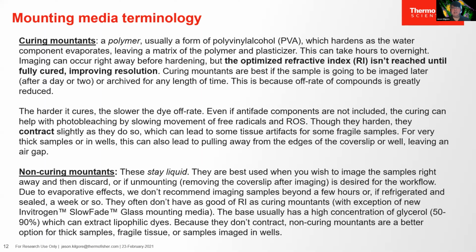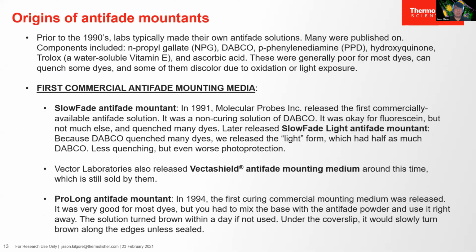Non-curing mountants stay liquidy. They don't harden. And this is good if you're going to image right away. So like our SlowFade products, if you're going to image your sample immediately after mounting and then discard your sample after just a few hours or a day or two, then you can go with a non-curing mountant. But if you're going to archive your samples for any length of time, I'd go with a curing one.